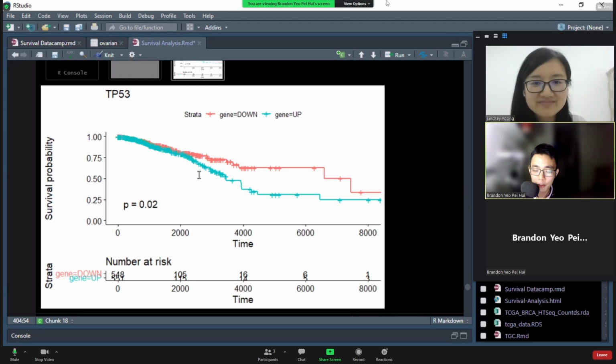But I feel like at the end of the day, people are watching a video, so having some nice looking graphs is always an advantage. So I've always been trying to do more of a nice looking thing rather than actually useful looking. This is the one that can produce the figures nicely, but for that one you need another ggplot to help visualize it.